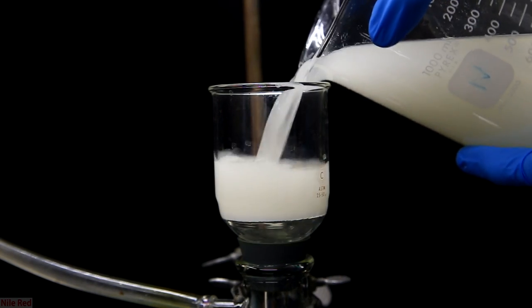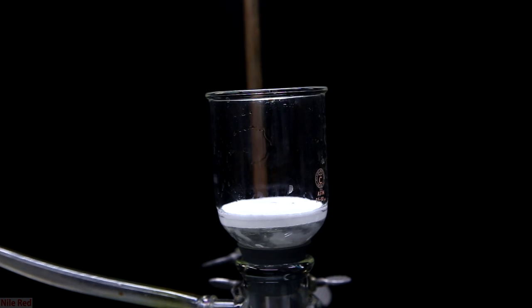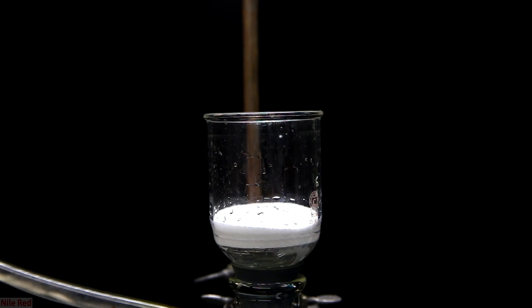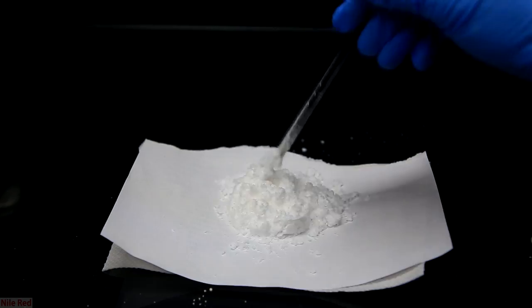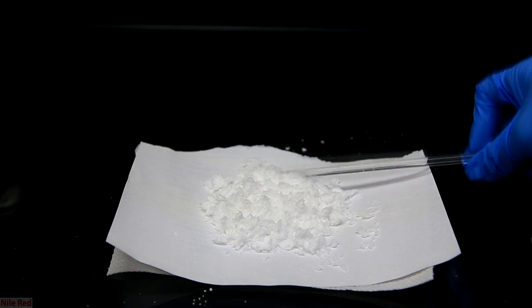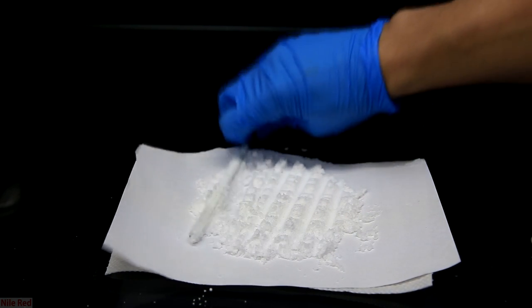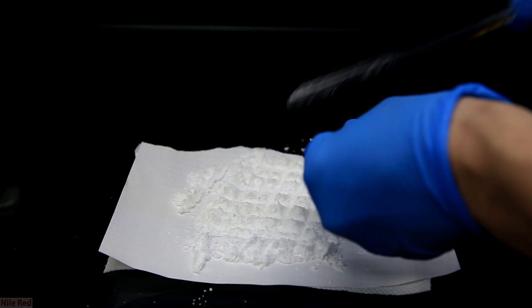The solution was then filtered by vacuum filtration, though gravity filtration would also work. I keep adding it to the filter flask, pulling a vacuum and removing the water. After everything has been added to the filter, I pull a vacuum for a little bit to try to dry things up, then transfer it to a piece of paper with paper towel underneath and spread out the powder to dry. Our product will be contaminated with a little bit of sodium sulfate because we couldn't do any water washing — hydrazine sulfate is soluble in water and if we washed it, we would lose quite a bit.